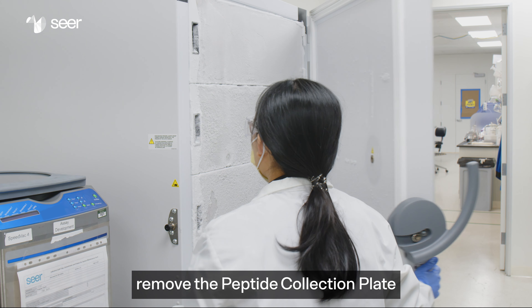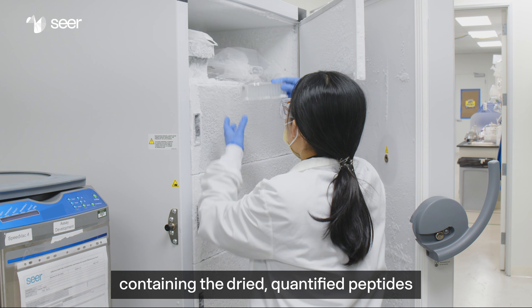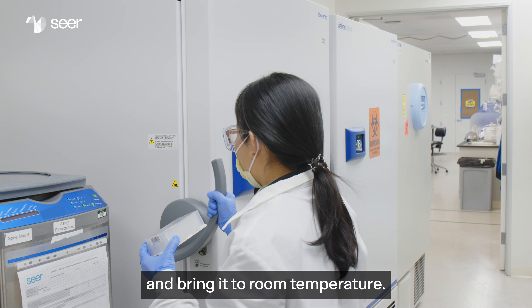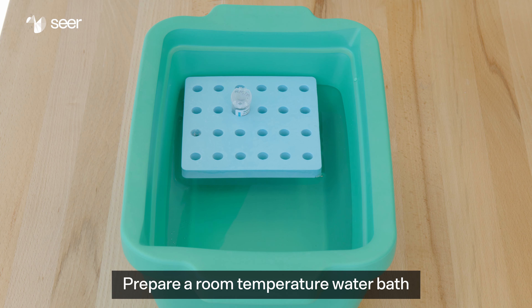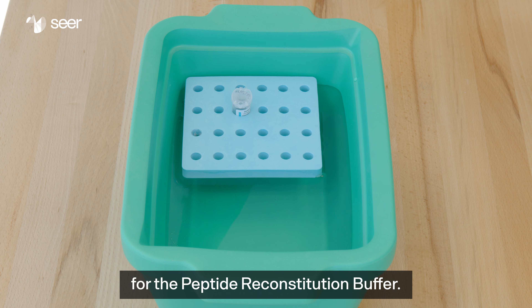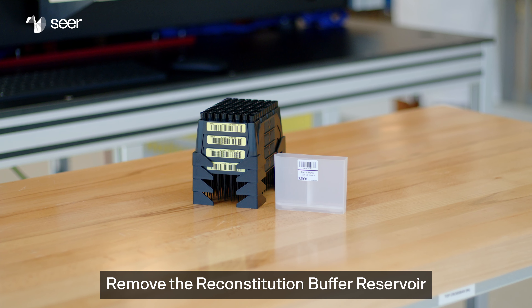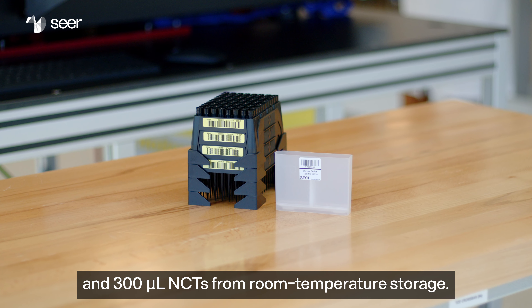If necessary, remove the peptide collection plate containing the dried quantified peptides from minus 80 degrees Celsius storage and bring it to room temperature. Prepare a room temperature water bath for the peptide reconstitution buffer. Remove the reconstitution buffer reservoir and 300 microliter NCTs from room temperature storage.